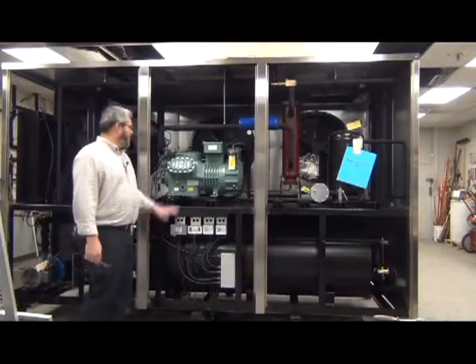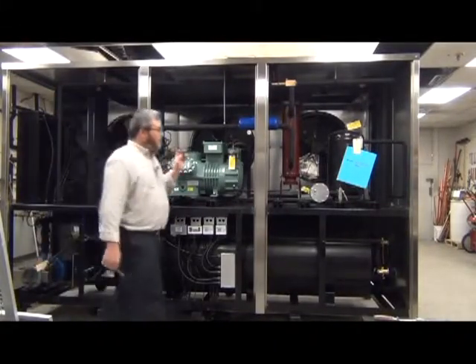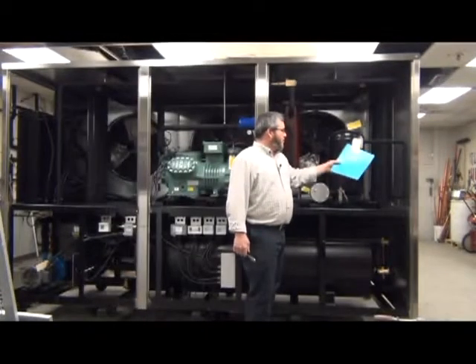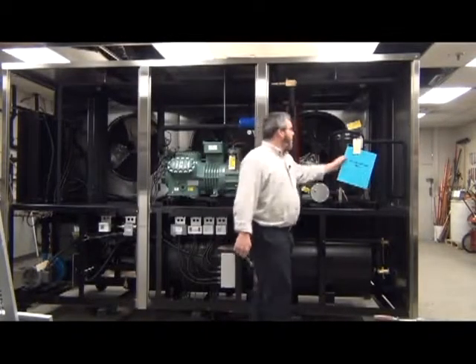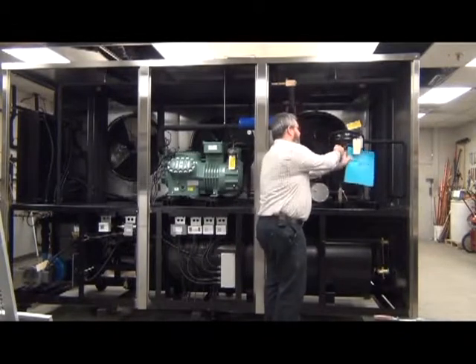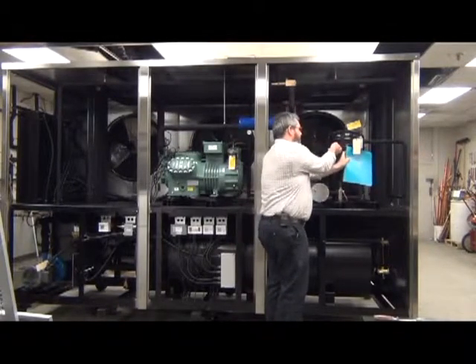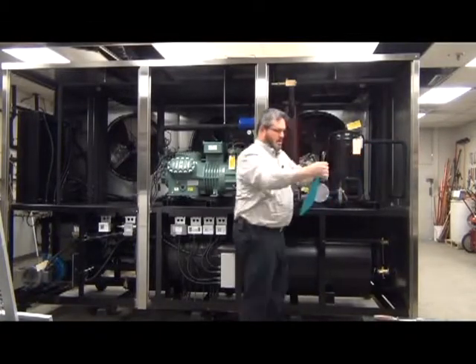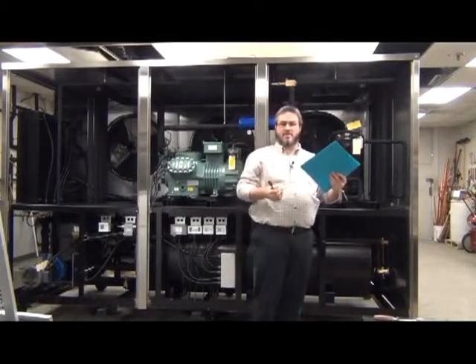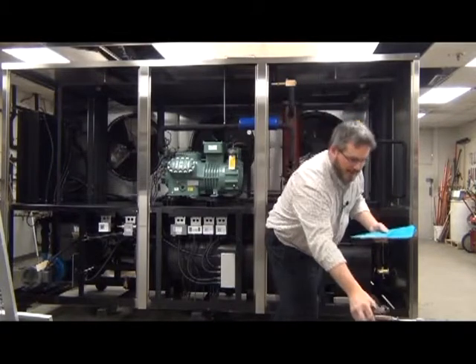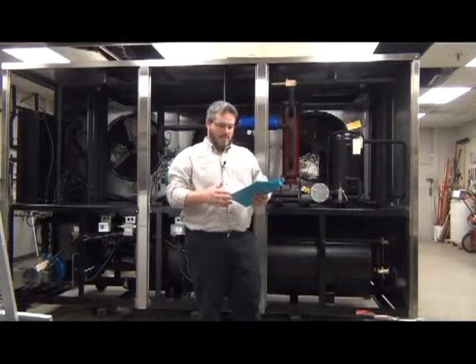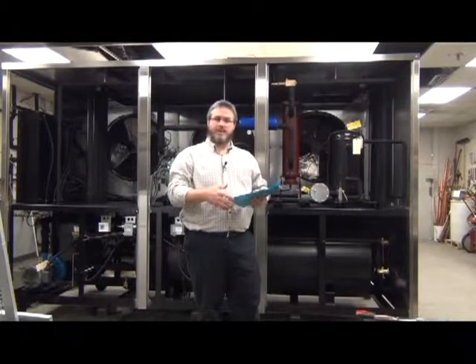Once you have all the panels that you need to remove from the chiller removed, you can go ahead and locate your manual, which will be in a folder that looks like this. It will be secured to the piping with a wire tie, which you can clip off with your diagonal cutters. This manual will contain all the information that you need, all the technical specifications, and all the information that you need for the startup, as well as a set of prints and electrical diagrams.